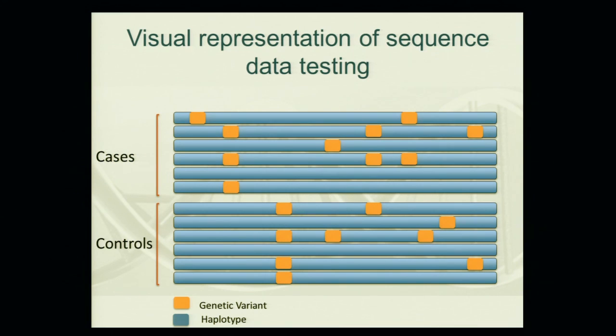Good. So we get variant calls. It goes through the sequencing pipeline. There's variant discovery and variant calling. That's what GATK is doing. And if you generate sequence data here, you will be delivered a VCF, which is a variant call file, which has all of the variation, under best practices at this point in time, that will represent all of the genetic variation that they've identified from the sequencing experiment. Okay, so that is the deliverable. If you have sequencing done here, that's what you will get.